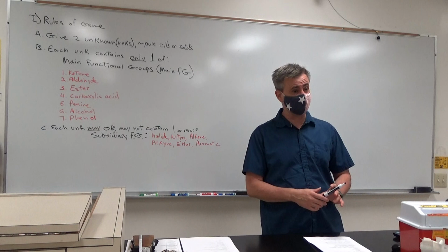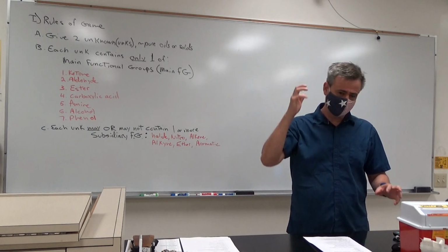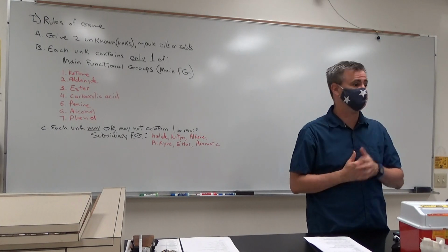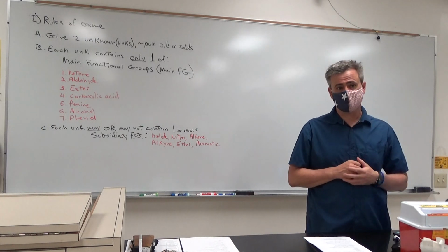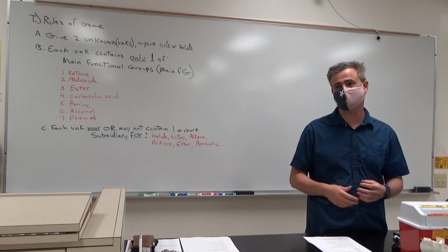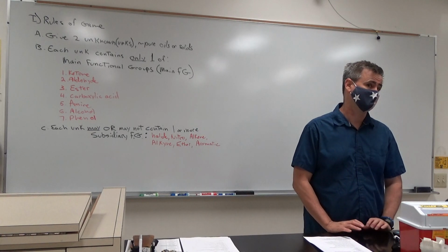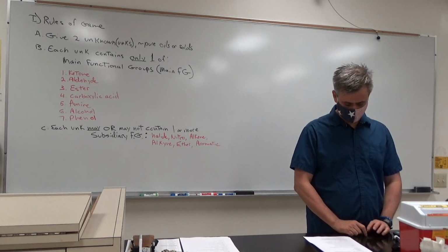We're going to do qualitative tests. Qualitative tests are ones that give some sort of reaction, some sort of physical indication that you have that particular unknown. You guys have learned those, you studied those for today, right? The 2,4-DNP test is for aldehydes and ketones, and so forth and so on. That'll give you good initial information on what your functional group is.